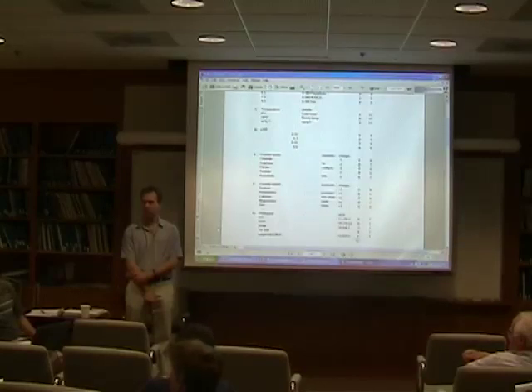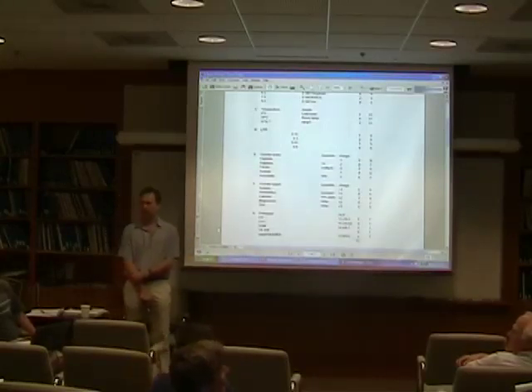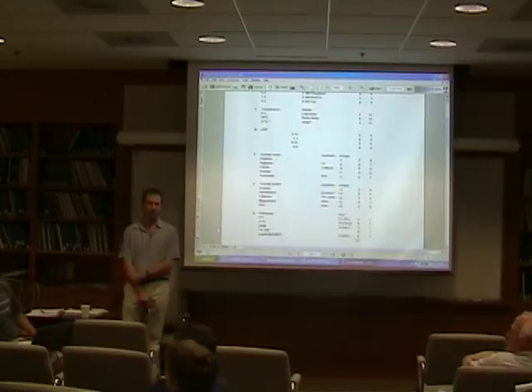It's the simplest. But you see the lipids floating. You can see that very easily. Yeah. And then you take this. Even if you get this band, you don't know whether it's just sticking on the membrane, whether it's incorporated. No, it's membrane protein. No, it's not. It's just impractical. Has it been working for you? But sucrose gradient, the people who are working on function, they are doing it every day. So it was very easy to do a sucrose gradient and to separate it. Maybe it's difficult in our hands because we're not used to doing it, but a sucrose gradient is a simple way.